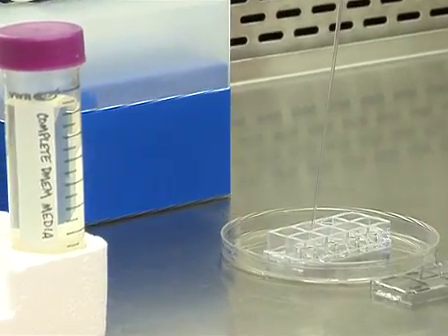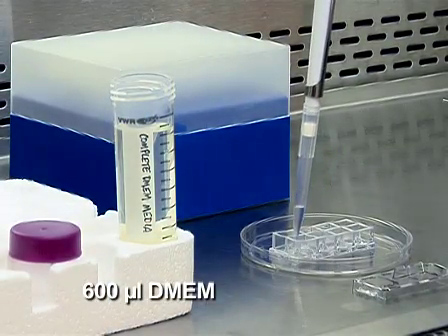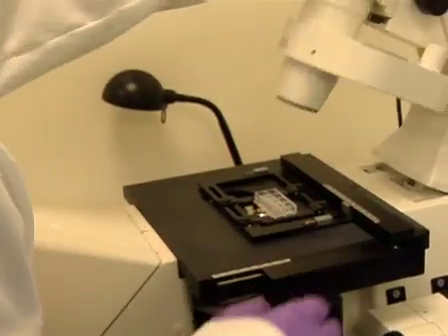After 30 minutes, replace the media on the SNAP cell samples one last time with 600 microliters of complete DMEM. The cells are now ready for imaging using a Zeiss Apotome Axiovert 200M fluorescent microscope.